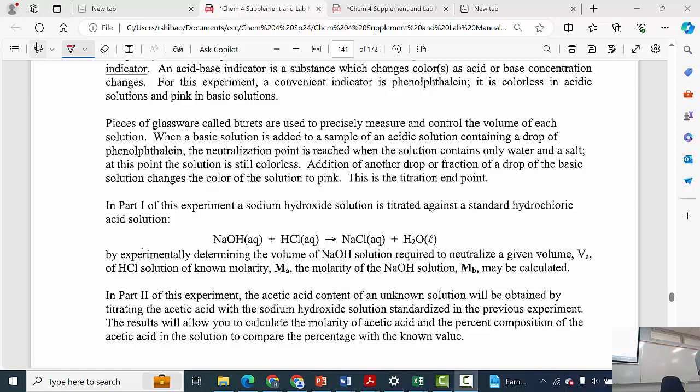One thing we don't know is whether the last person that used this cleaned them out. There could be residual sodium hydroxide. So even if you're washing the dishes, you can't assume it was clean, or that residue can't hurt you. There could be sodium hydroxide residue here, and we don't want to get that splashed in our eyes. What I have here is a big waste beaker. I don't want to walk back and forth to the waste bucket over there, the gray ones or the red ones, so I'm just going to dump all my waste at my lab station.